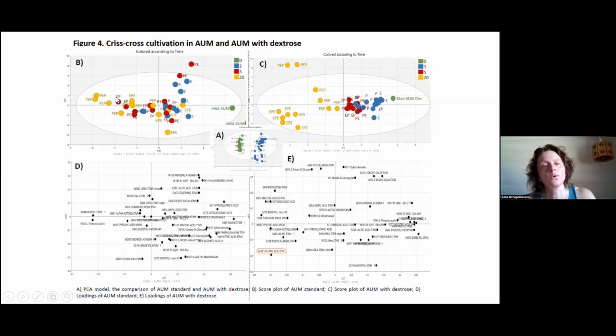And PEP or EP means Pseudomonas, E. coli, Pseudomonas. This is a succession of the strains of the species in this sample. Anyway, we can see a trend in this graph going from media to the samples of 20 hours, and that's quite clear. But still, the separation here of Pseudomonas and E. coli goes a little bit up also, so we can go in two different directions.